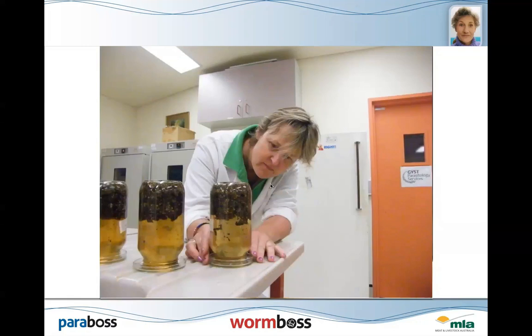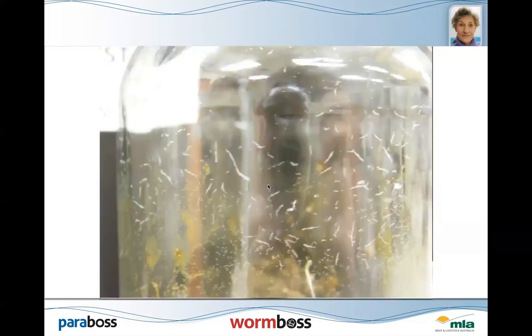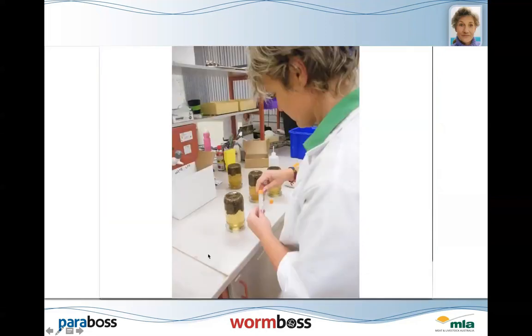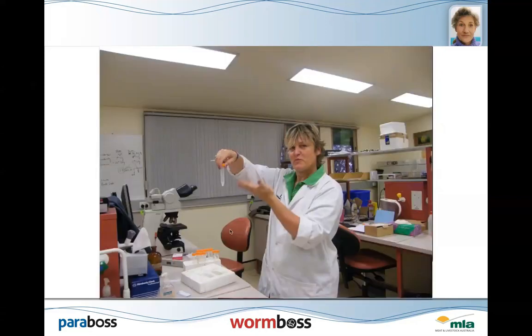Now, what happens next is water gets added to that jar, it gets turned upside down and put into a petri dish, and a little bit of water is added, and it's just left for a little while. And then, after that, the larvae sort of come down into the bottom of the petri dish. You take up some of that liquid, put it into a test tube, and then leave that sit for a little while, and after a little while you end up with the larvae all down there in the bottom of the test tube.